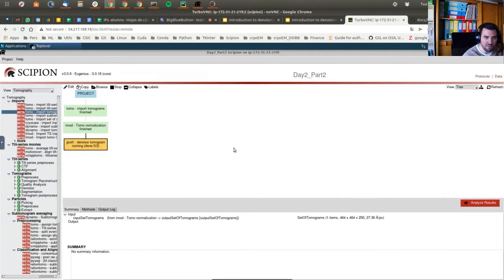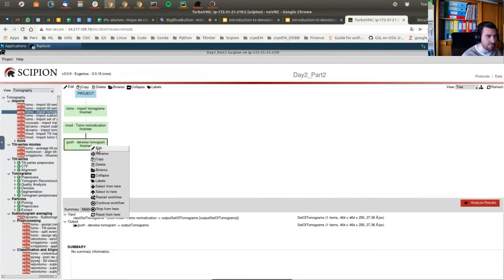Okay, thank you, Paulo, for helping Francisco. Jorge? Yes, Maria Jose? Could you go slower and repeat the last step, please? The denoise. Yes, thank you.